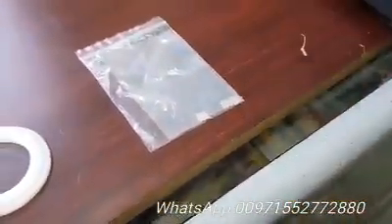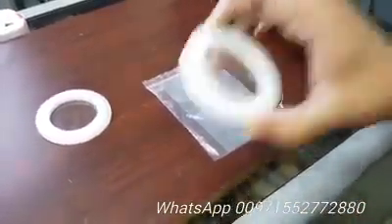It's a pure silver — the machine gets calibrated by pure silver. We also have two extra lenses. If your lens gets scratched or broken, you can replace it.